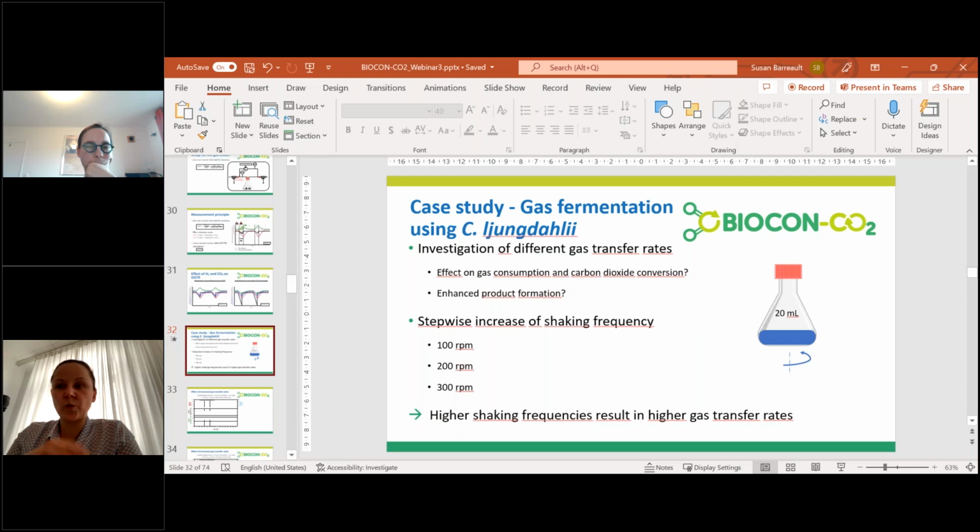Since carbon dioxide is really soluble, we would rather have a hydrogen limitation. Further tests have also shown that while you have carbon monoxide in your system, since it is energetically preferable, the organism will always go first for the carbon monoxide. And then with the additional hydrogen, it will first consume the CO2 which it produces itself. If we keep the carbon monoxide concentration quite low and feed extra carbon dioxide and extra hydrogen, then we do see excess carbon dioxide consumption.